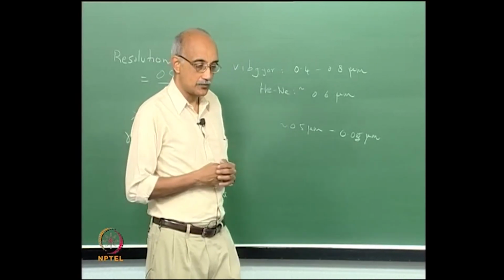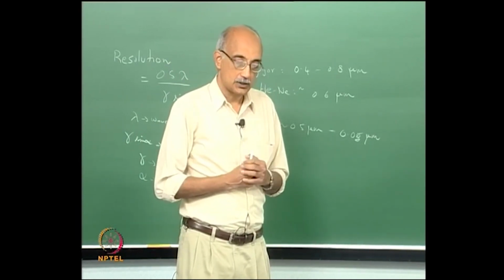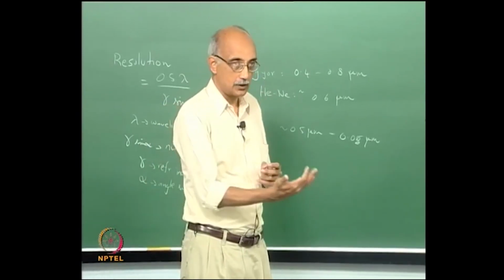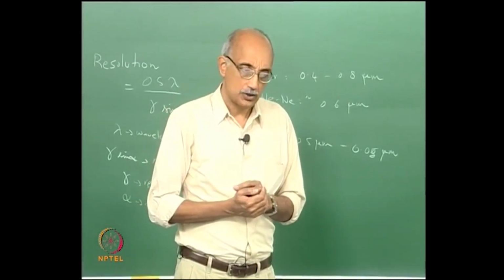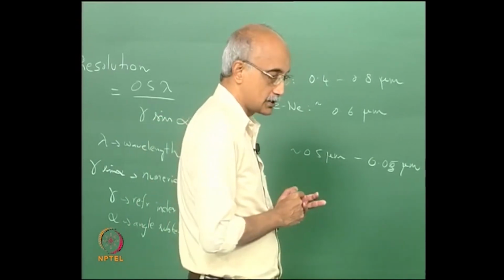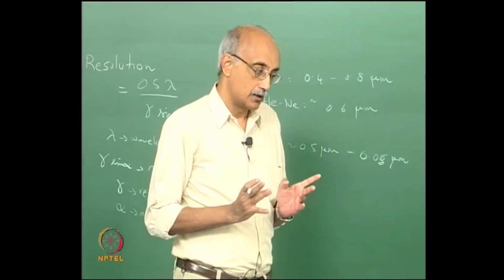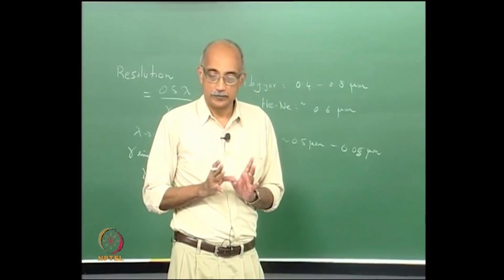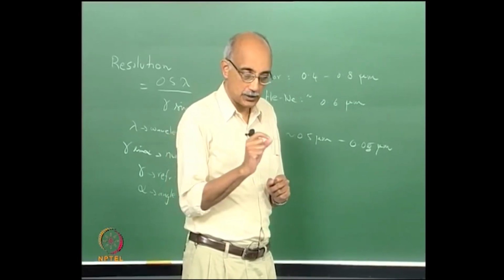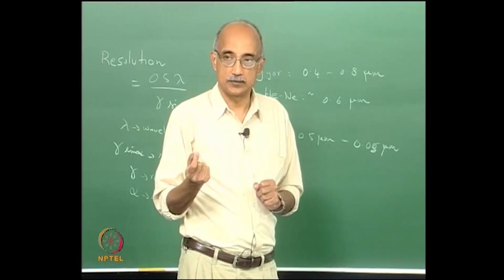The same surface, if I were to inspect it under, let us say, normal lighting versus high intensity lighting, focus lighting, or even oblique angle lighting, would show up particles very differently. And so one of the tricks used in optical microscopy is that conventionally, in what is known as bright field microscopy, you illuminate the entire surface with bright light, and defects and particles on the surface will then show up as dark spots.